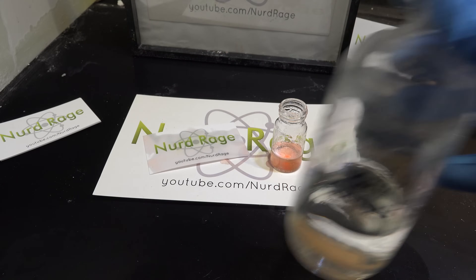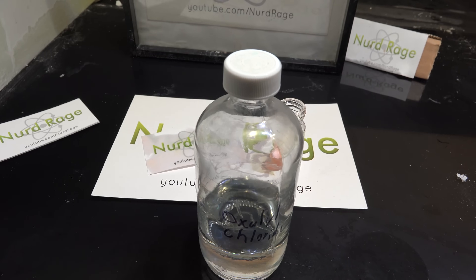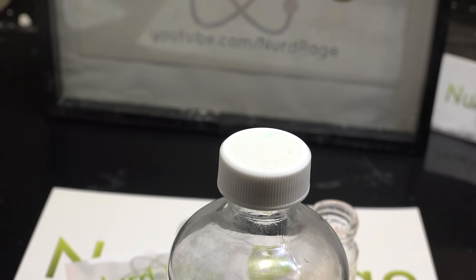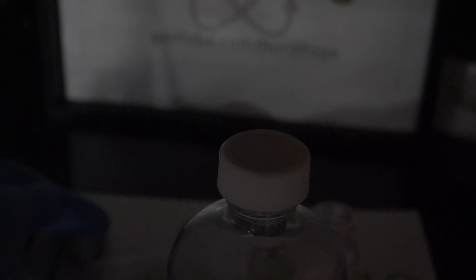Now for the key ingredient: oxal chloride. This stuff is quite volatile and you'll need to work with it in a fume hood. We're going to use the vapors from this oxal chloride to create chemiluminescence. Now turn off the lights and hold the card near the cap of the bottle and open it.